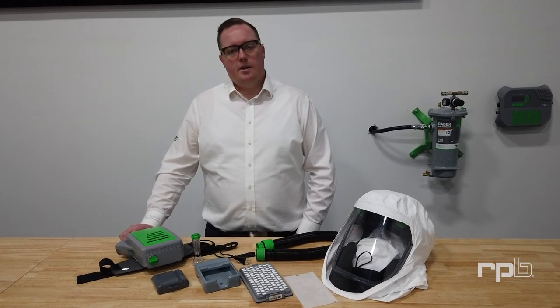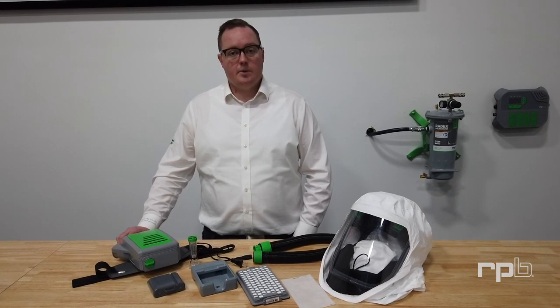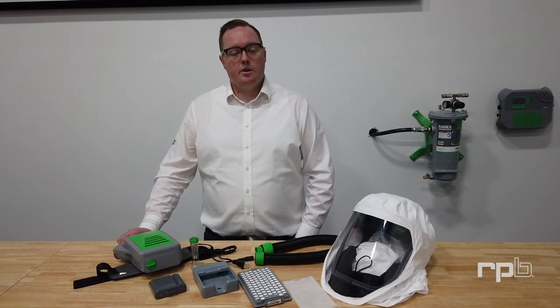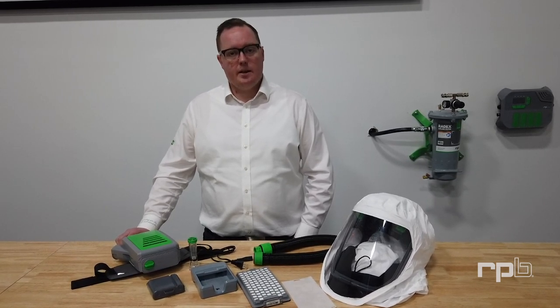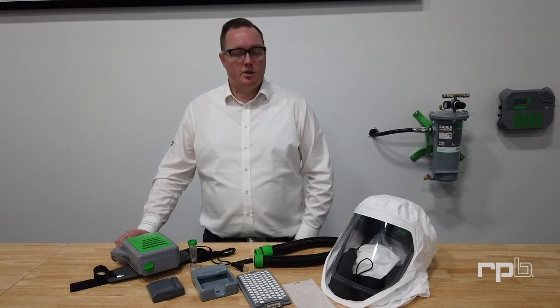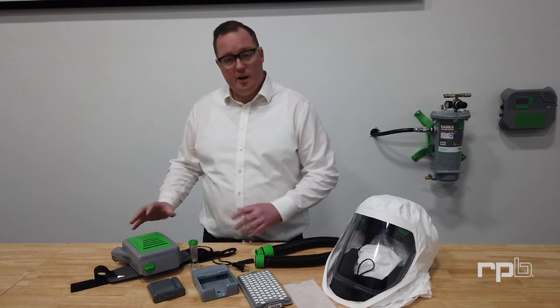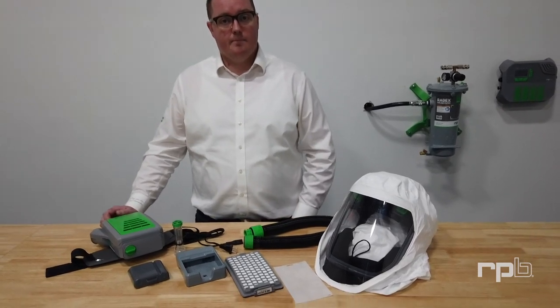Welcome. I'm Edward, the Training and Technical Sales Manager for RPB Safety. In this quick video, we're going to explain setting up, donning and doffing, and cleaning your T-Link and PX5 PAPR respirator.